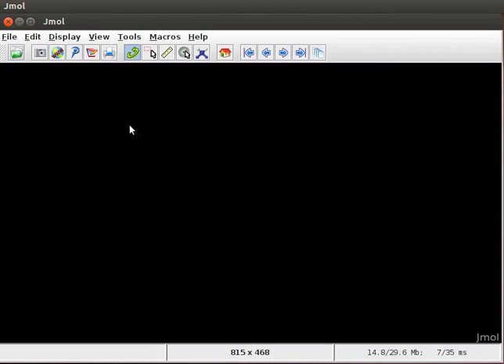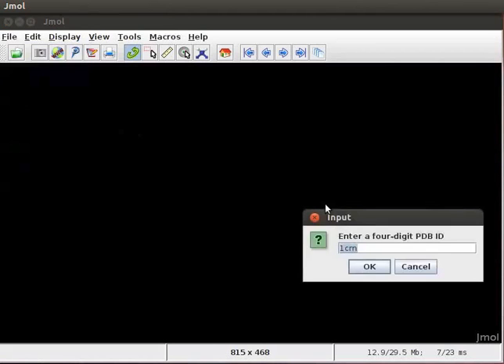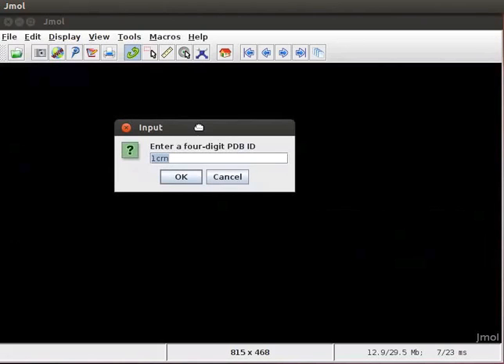3D structures of biomolecules can be viewed by direct download from database. To do so, click on file menu, scroll down to get pdb. An input dialog box appears on screen. We have to type the 4 letter pdb code for the particular protein in the input box.